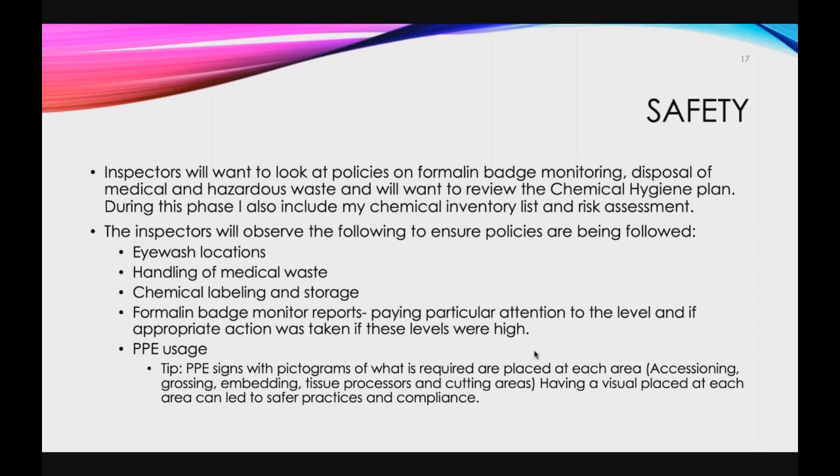I'm not sure where everybody orders their formalin monitoring from, but we use a company that sends an email right away when the results are in, whether it's high or normal. It has all the descriptions of everything, the value, what it should be, where it's at, and then a line at the bottom that says reviewed by employee and the date.